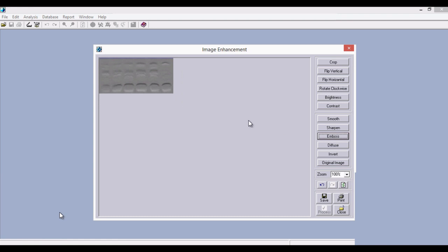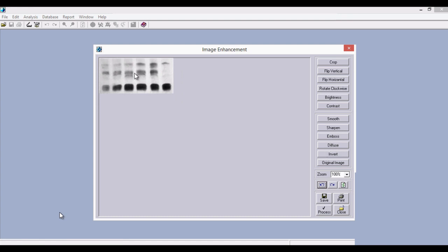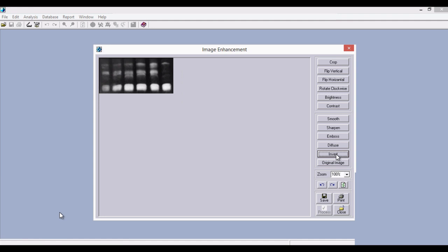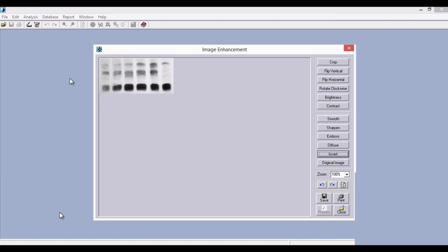You can use the option emboss to see the presence of the bands. Although this embossed image cannot be used for analysis, you can use it to find how many bands and lanes are present for reference. Similarly, diffuse also cannot be used for analysis but you can see the bands and lanes. The option invert is used to invert the image background. This is a protein gel image where the background is white and the bands are dark. For a DNA gel image, the background is dark and the bands are white. For this 1D gel analysis software, the background should always be white and the bands always dark — this is where we use invert. All dark colors become white and all white colors become dark.